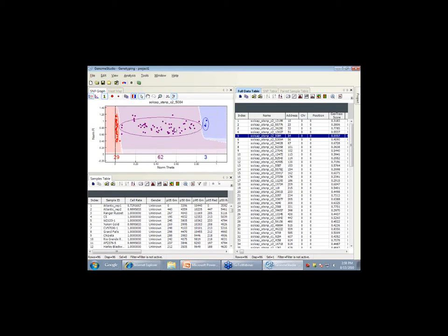So I just clicked on a marker here, number 5 in this case. To change the clusters and what to keep, you can hit the Shift key. You press the Shift key, and you see this crosshair when you go over the middle of it, and you can say, I really think the heterozygous cluster should be a little bit over to this side. So what did that do? All I did is shift it to the right. Notice that the point down here, now red and off the axis, is going to be called an AA allele instead of an AB allele, a heterozygote, because I've moved that cluster.